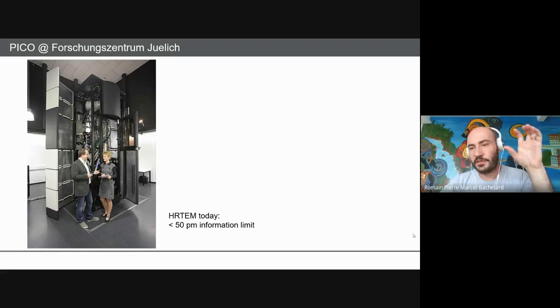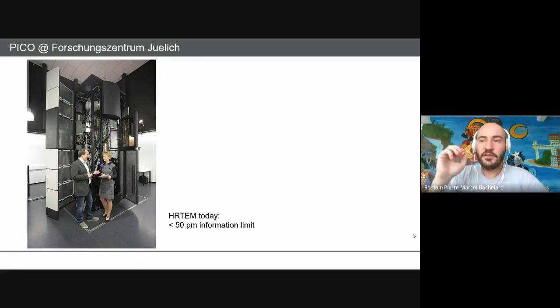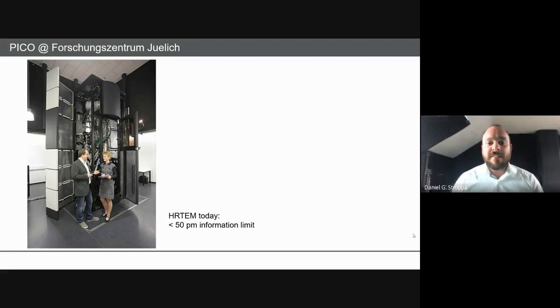Okay, so historically, when you think of that big Hitachi that I showed, the megaelectronvolt microscope, the size was mainly the acceleration region, where you start emitting electrons and then you have a series of capacitors to speed up the electrons to the acceleration voltage that you want. If you want to get 1 megaelectronvolt, you need a very long acceleration tube. Today we're working in this range of 300 kV maximum. This is what you get from everyone working in the field. So that size is under control.